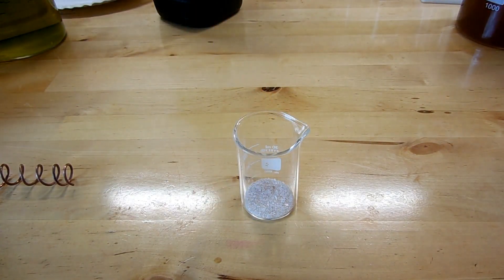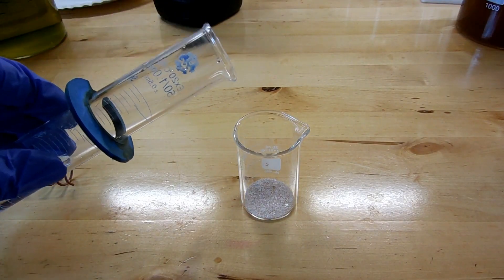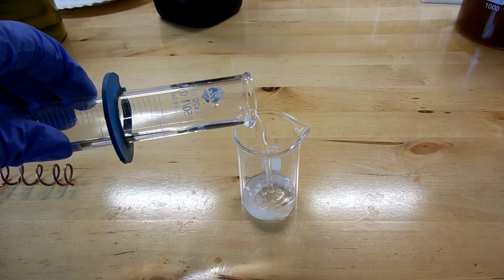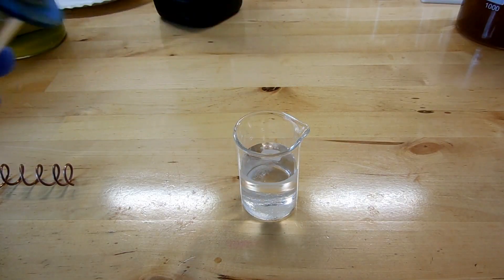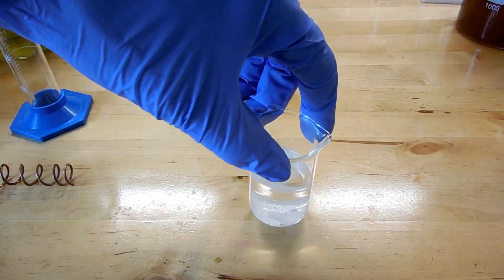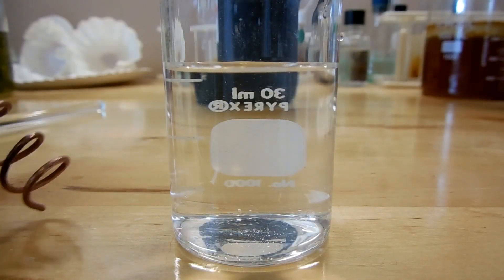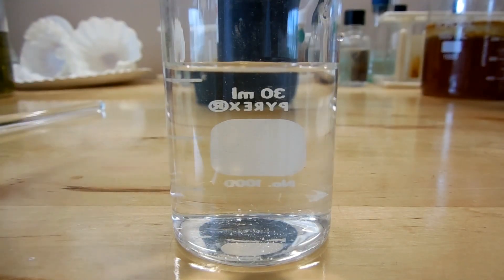But anyways, that's my 1.6 grams of silver nitrate, and now we're going to dissolve that in about 25 milliliters of water. Silver nitrate is very soluble, so this should dissolve in no time at all. Okay, I've got my solution made, and now I'm just going to toss the little coil of copper wire into it.